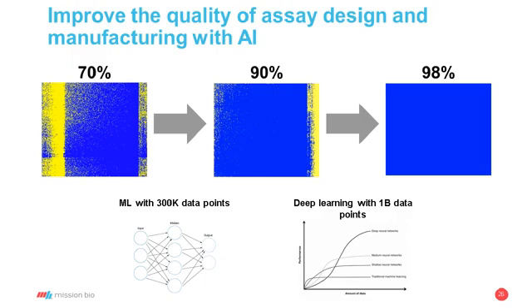And we try to build all of this into our bioinformatics pipeline on the back end of the designer tool so that it's doing its job transparently to you, to be able to design the set of amplicons that we think are going to work as best as possible.